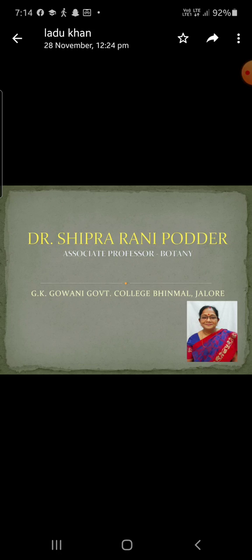A single vascular bundle is present in the midrib region. It is surrounded by a parenchymatous bundle sheath. The vascular bundle is conjoint, collateral, open and diploxylic. It has a large triangular centripetal xylem and two small groups of centrifugal xylem, one on either side of centripetal protoxylem.